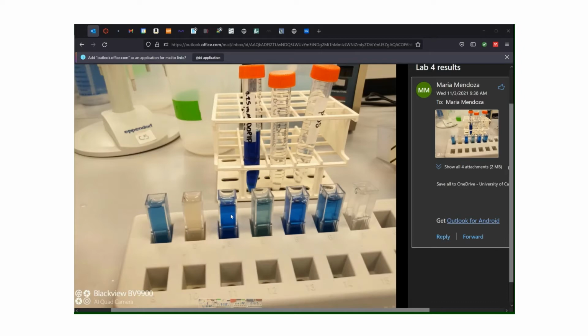And then in the mitochondrial fraction, we don't have anything. And then in the, I forgot which fraction this is, it might be post-mitochondrial, but there it's light blue, so there is activity here. So for each of these in the discussion, you can group them together, like these two can be grouped together. You can say in this and this fraction, there's almost no activity because the color is pretty dark blue. And you can say what that means, you know.